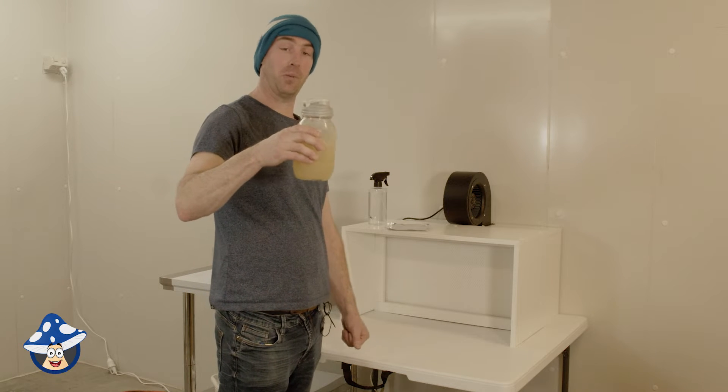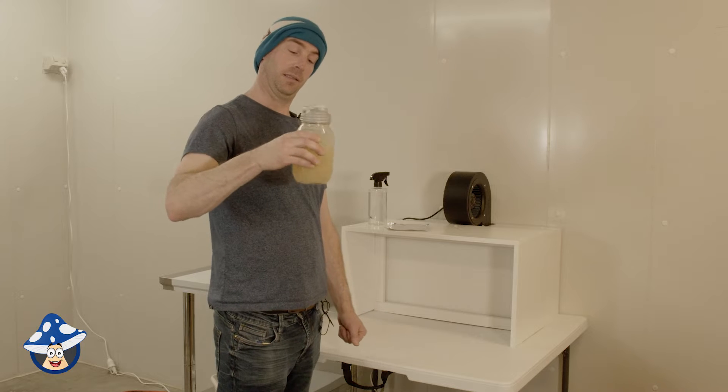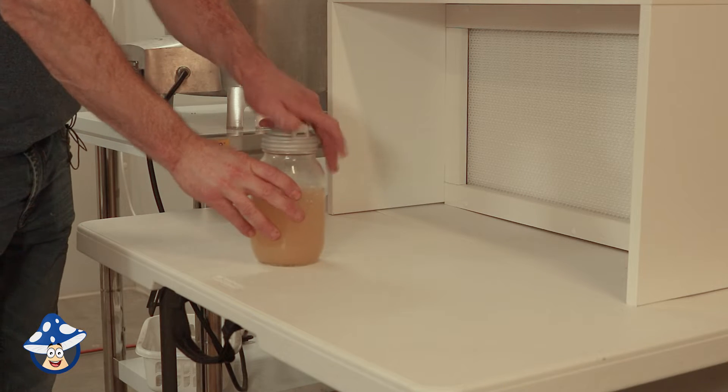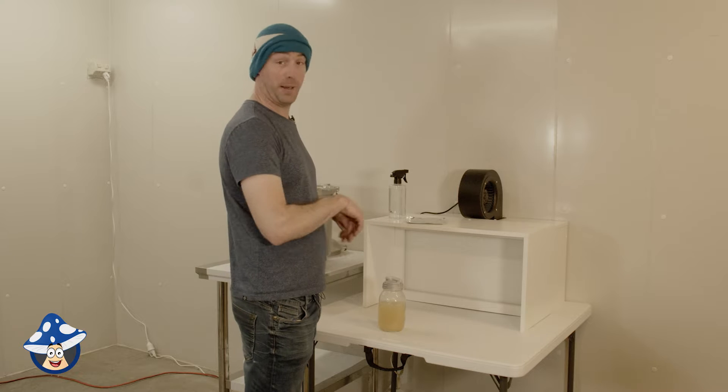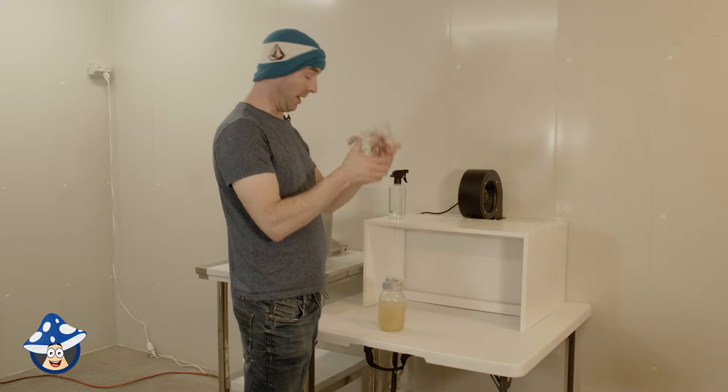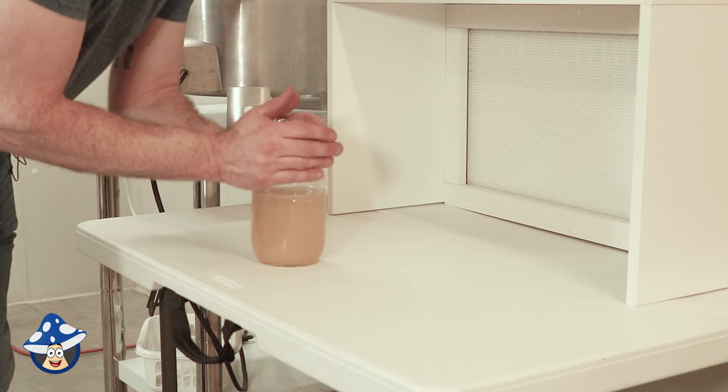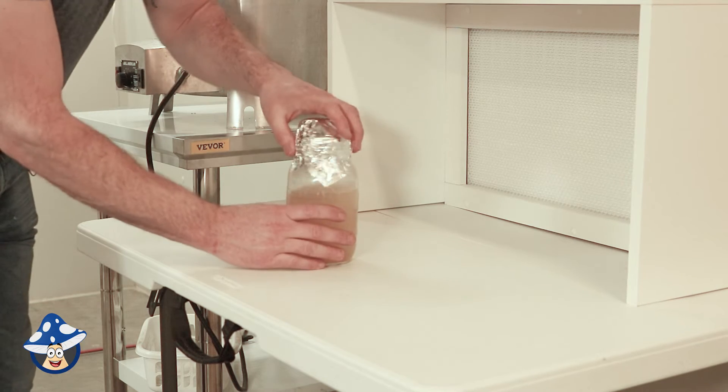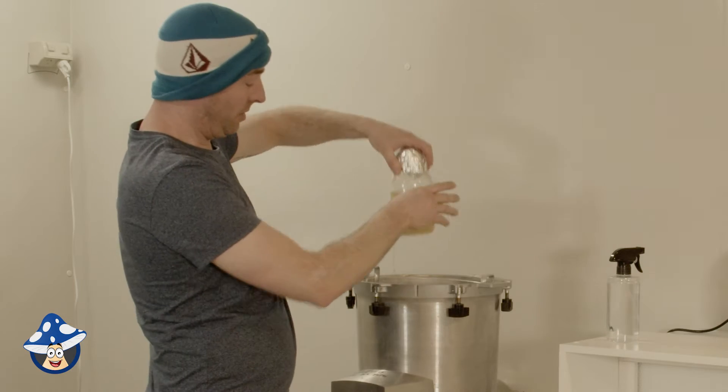And give it a good mix. You can use a spoon, knife, fork, whatever. Make sure you mix it up really good. And then loosen the lid, because when you're sterilizing, the steam is going to get in there. And then we'll cover it with some foil. Make sure it's loose. And in the sterilizer, it's going to go.